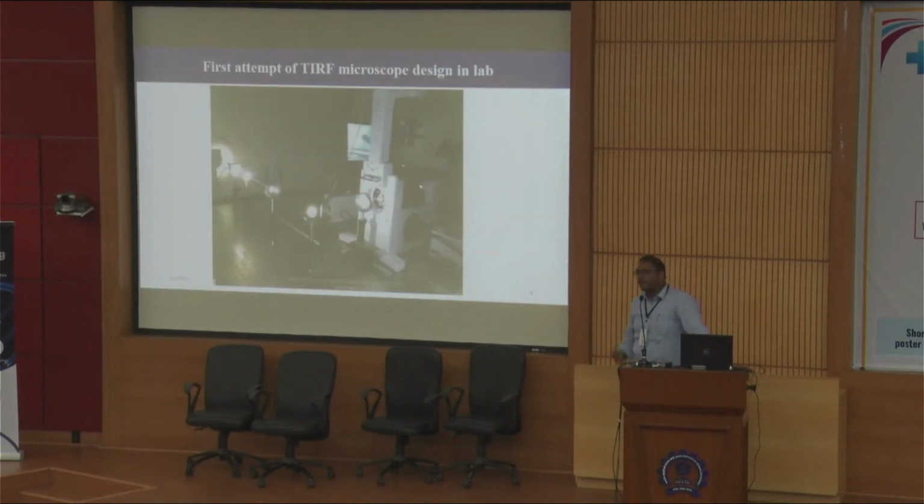I basically started my career building a system called TIRF microscopy. One of the things we wanted to try was, can we build it by ourselves? We can buy these commercially for a couple of crores, but we wanted to spend some time and learn how these things work by building it ourselves. It took us a couple of years. This was 2012, when we learned how to build a microscope. This gave us confidence that we can build stuff. Then we applied to a DBT project to miniaturize this TIRF microscope, and fortunately they gave us a grant and asked us to build.